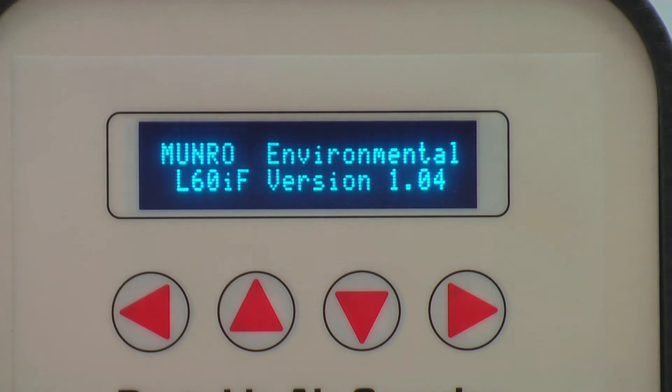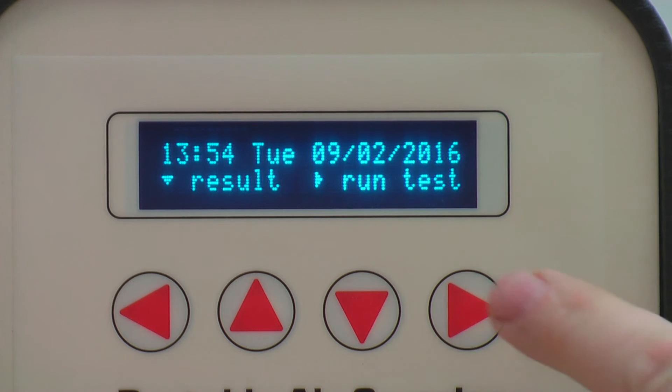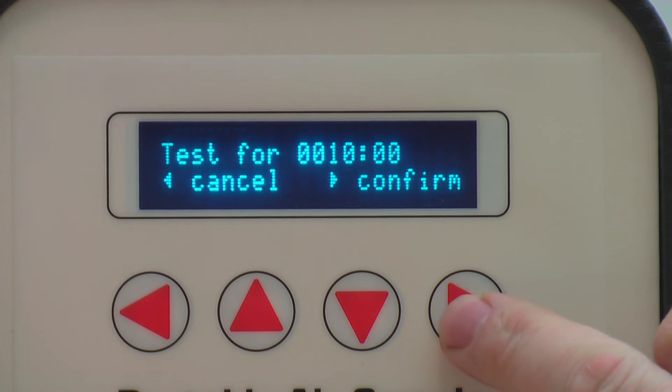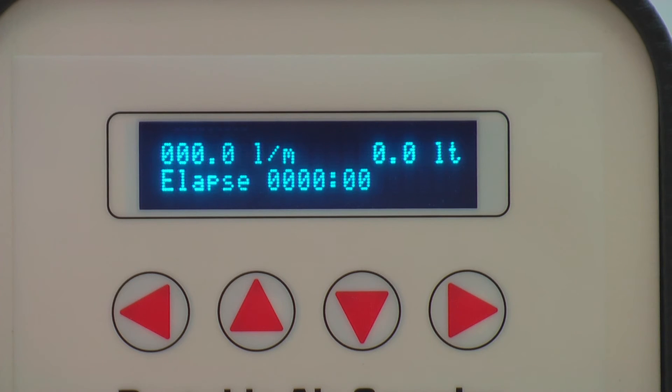For this example test, we have selected liters as our unit, which was set as auto in the configuration menu. The LCD shows the elapsed time, the current flow rate, and the overall volume sampled. Stop the test at any time by pressing one of the arrows or by turning off the air sampler.